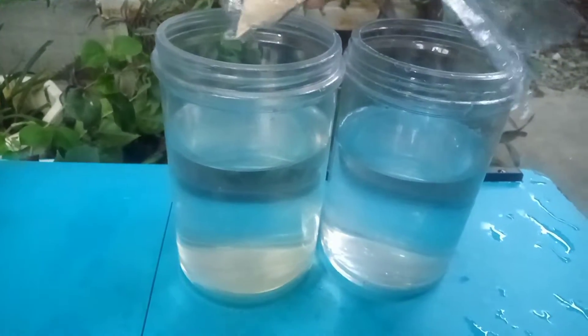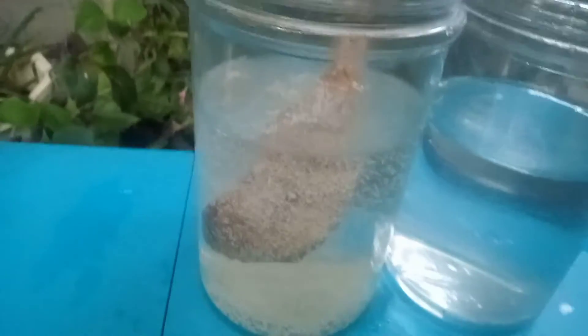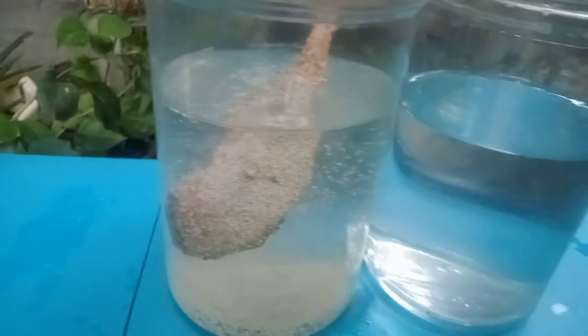As you can see, there are two containers. One should have yeast and the other one shouldn't. Firstly, you need to put the yeast on the water. Dried leaves should be added after the yeast. The sugar on the dried leaves serves as food for the bacteria and other germs.